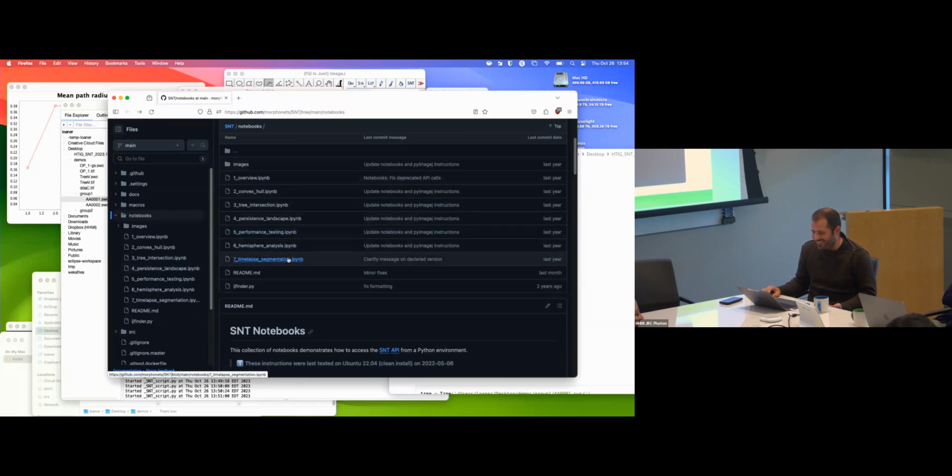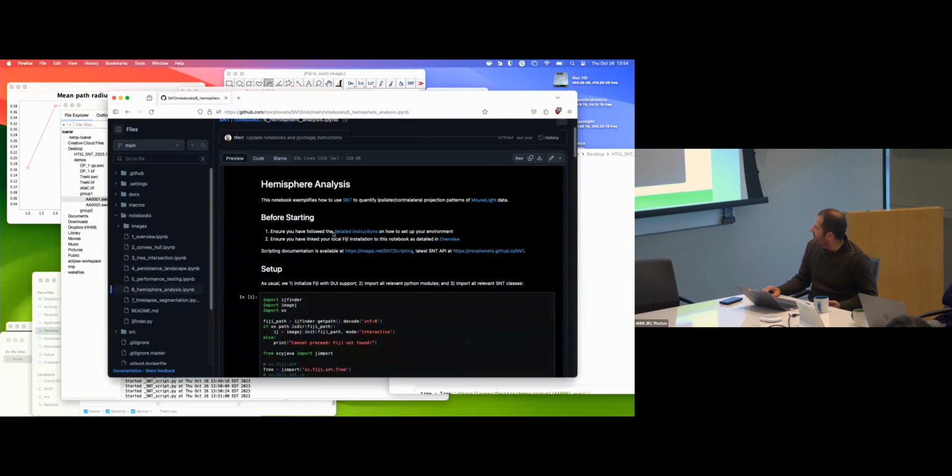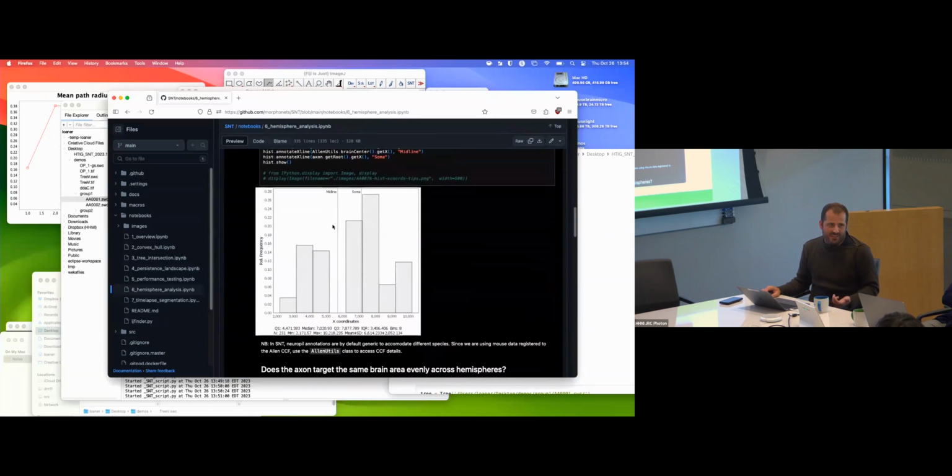And then there is another one. I don't know which one it is actually. I should know. That we use Blender to render actually. And there was nothing fancy about it. It was just because then we can showcase. I mean, since we're using Python.